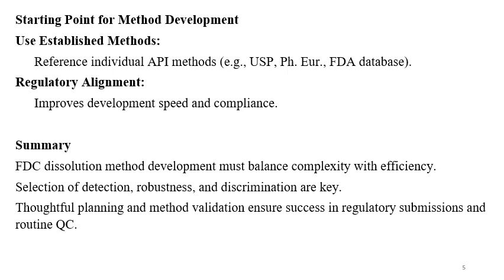Always do a literature survey to come up with the specific single API method available for the simple type of formulation, and then you can start working on the FDC. Then selection of the detection method, robustness and discrimination are the key points in FDC dissolution method development.